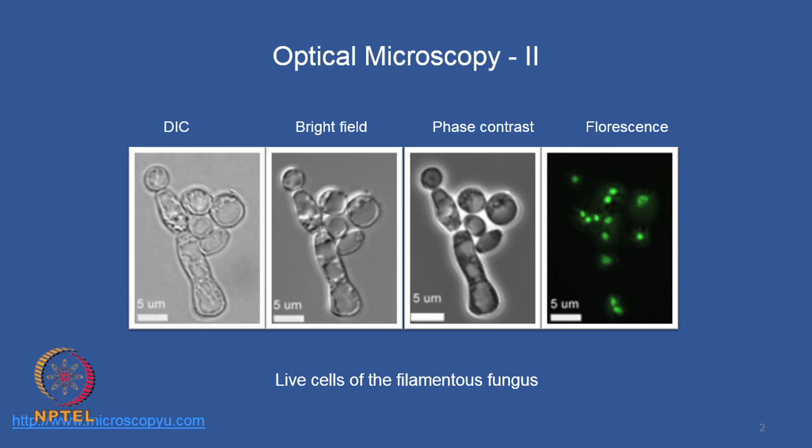I would like to begin by showing this slide. It is a very interesting slide taken from microscopyu.com. The purpose of showing this slide is that these images are taken from live cells of some fungus, all at the same magnification, but you see the different types of contrast you obtain from different variants of this optical microscope.